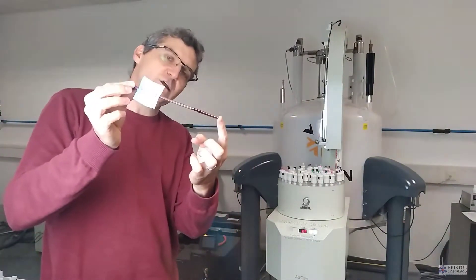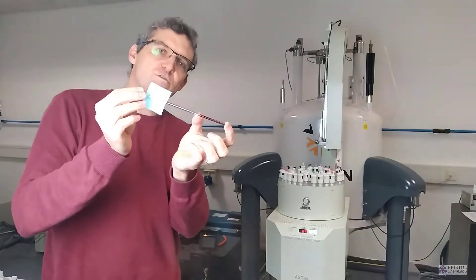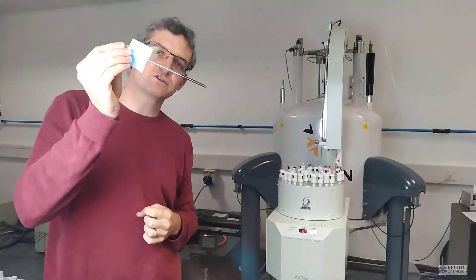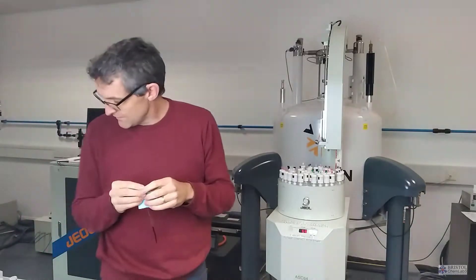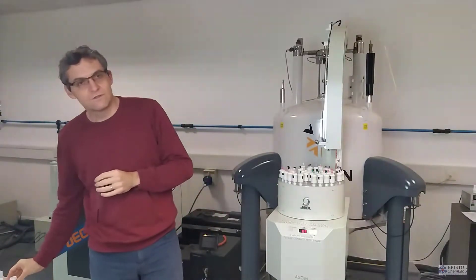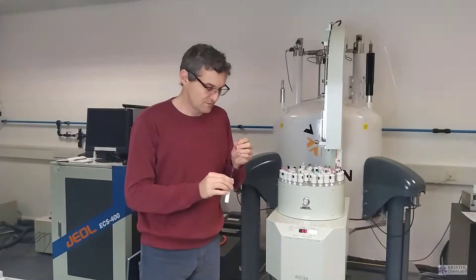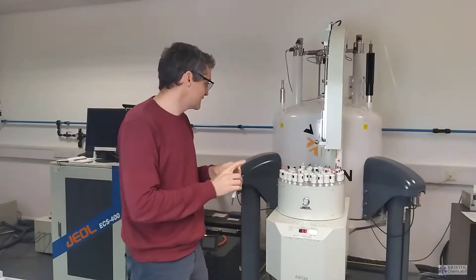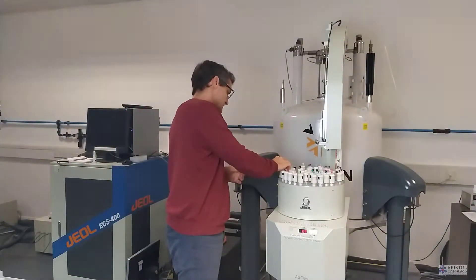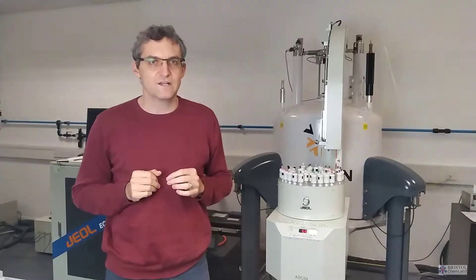So that's just a slightly pink compound, this one. It's dissolved up in a solvent and they put it into this glass tube and then they load it onto the NMR spectrometer. They simply place it into the robot and then submit it on the computer and run an NMR spectrum.